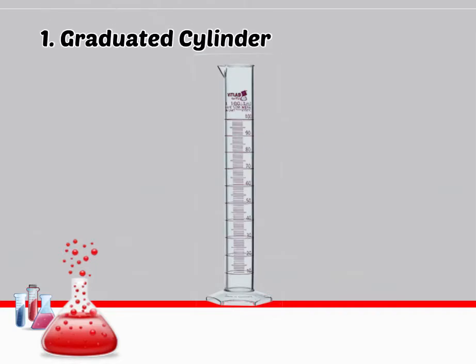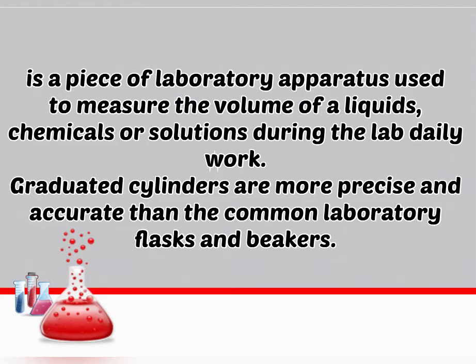First, we have the graduated cylinder. It is a piece of laboratory apparatus used to measure the volume of liquids, chemicals, or solutions during daily lab work. Graduated cylinders are more precise and accurate than the common laboratory flasks and beakers.